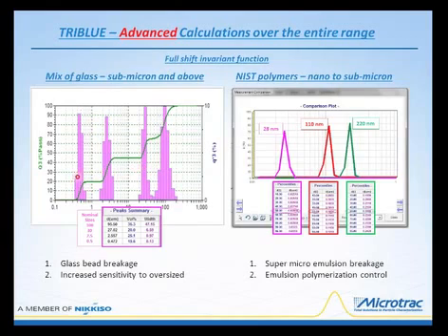On the other hand, if you're trying to make glass that's very, very small, down in this region here, on the order of, I'm going to say half micron, then if the sizes are getting too large as you go through your process of making this, you'll know when to stop the process and avoid making these larger particles, because if this is the material that's desirable to be made, then there would have to be another step in the process to remove any of these large particles that might develop.